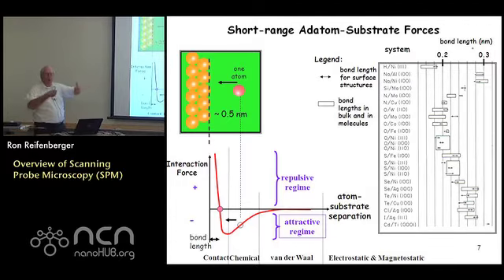You can shoot particles, you can shoot atoms at substrates and try to measure the trajectory of the atom, and then work backwards knowing the force versus distance to try to interpret the trajectory that's measured versus the force that's governing the motion. But that's a hard problem, right? Up until 1980, it was extremely difficult to measure the shape of this curve.